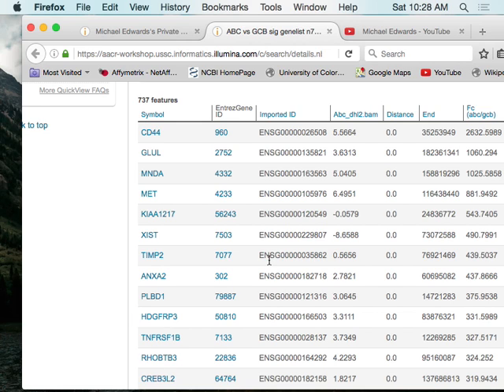I think this is one thing I really like about BaseSpace, the correlation engine, is that it ranks them based on your fold change and p-value, right? So it'll take the absolute fold change and rank those, and then it'll rank your p-values, and then it kind of takes an average of both of those and uses that number to rank these. Everybody see that?